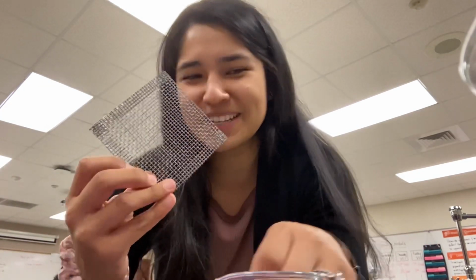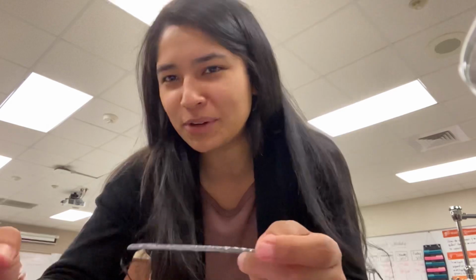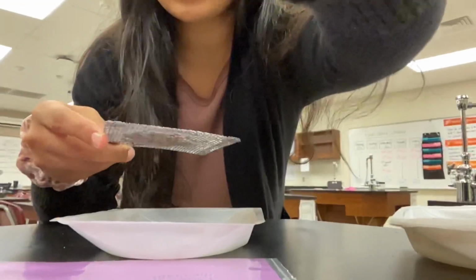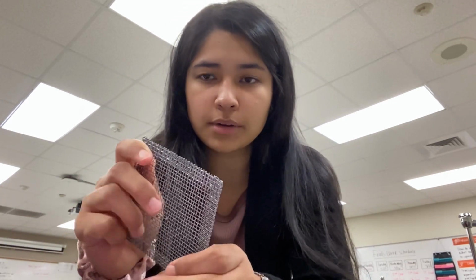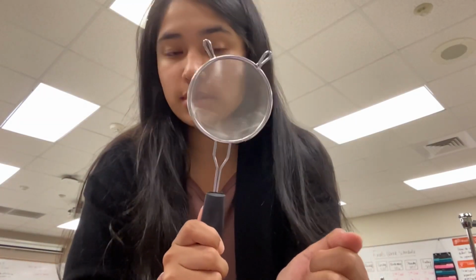So we can use different sifters. We have this wire gauze. Coach McComb reminded me of the name, so thank you for that. I couldn't remember it on the other video. So I'm going to take my mixture, use this larger one, and start separating. Hopefully you can see we separated the larger pebbles, and I'm going to use my original beaker to place them in there. Of course, some of the smaller pebbles went through, which means my larger ones are here. That one's been separated. I'm going to use a different size sifter now, and that's exactly what I will do next.